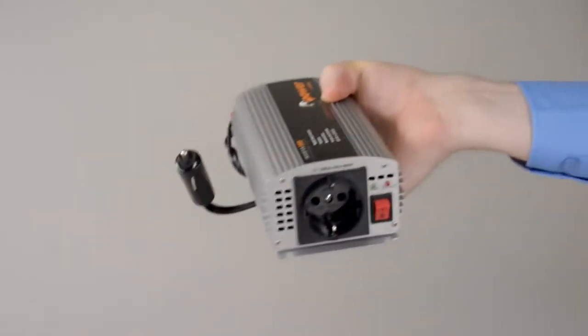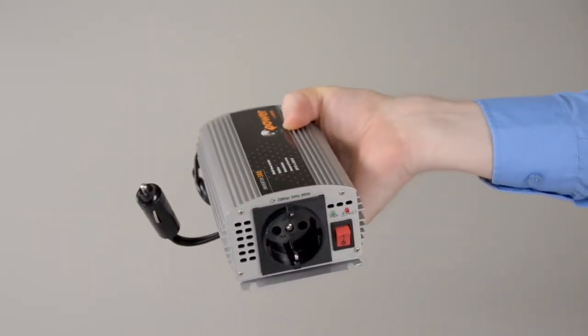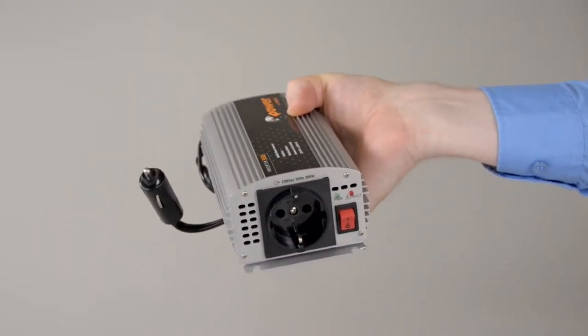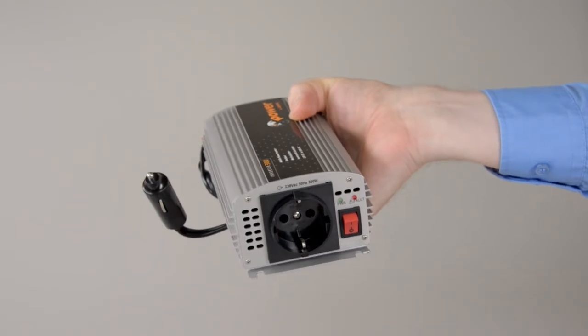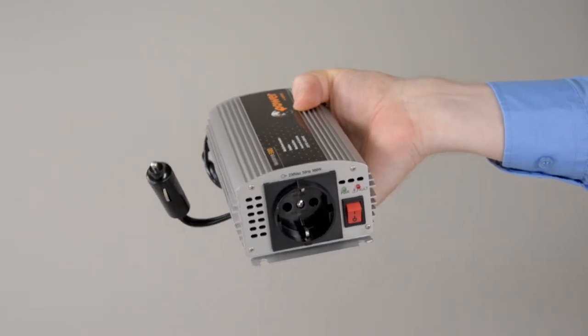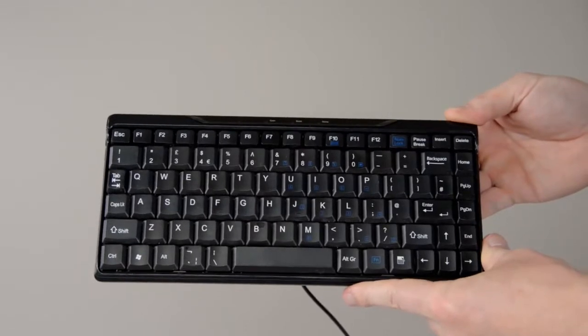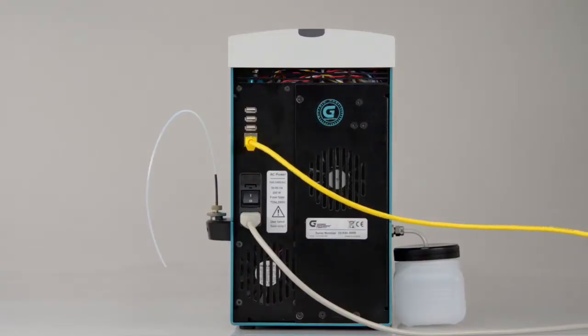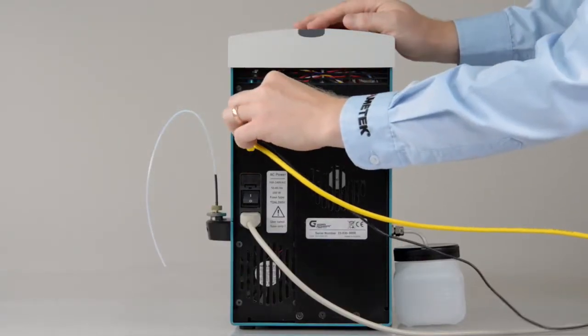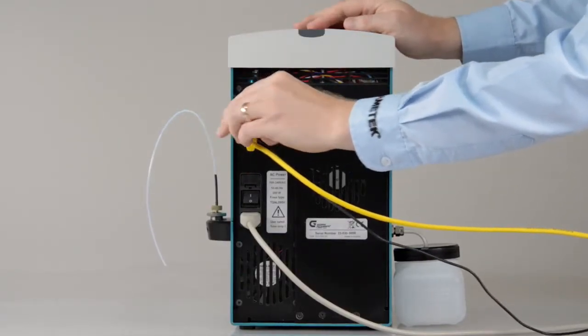If you connect to a vehicle battery, a 12-volt power converter is required. If you want to use a keyboard, attach it to a USB port on the rear side of the instrument.